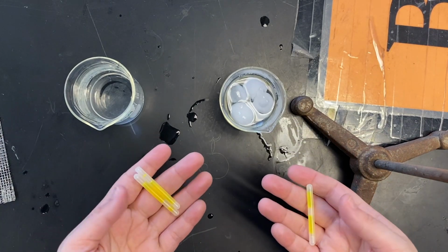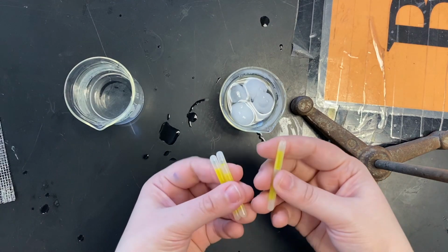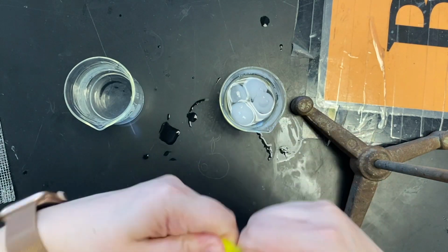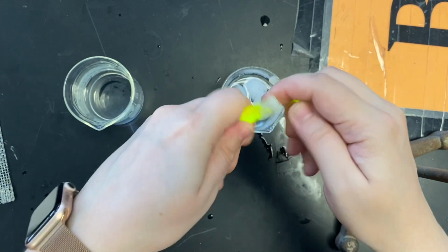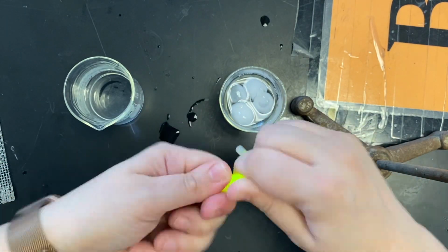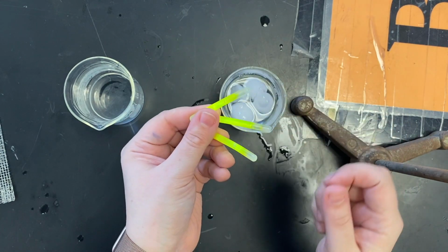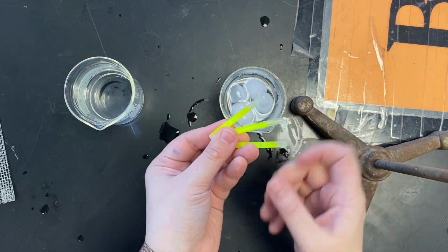So once you have your glow sticks and your hot water has been heating up for a little bit, we're going to break our glow sticks. Break them, make them light up. Okay, so we have our little mini glow sticks. Now they are glowing. So now we want to see how the temperature affects the brightness of each of these glow sticks.